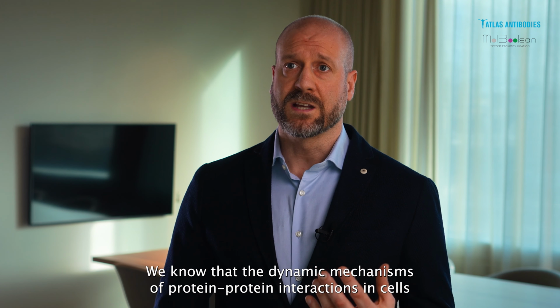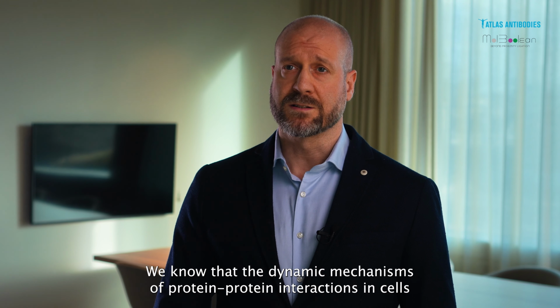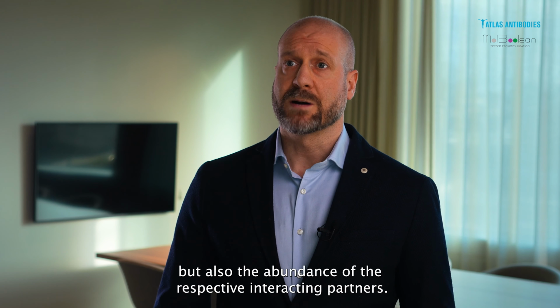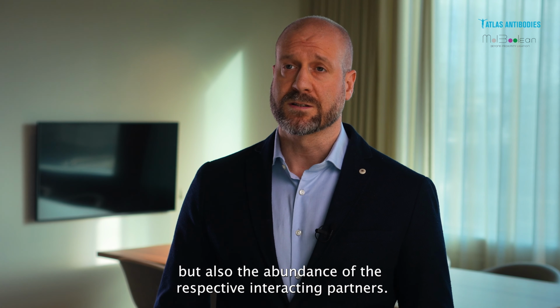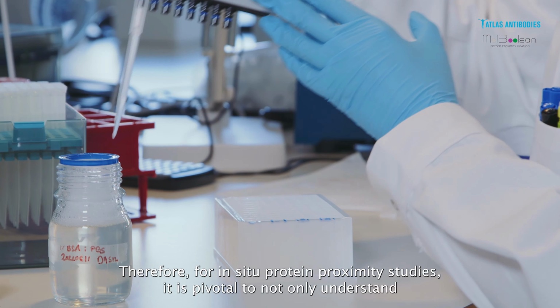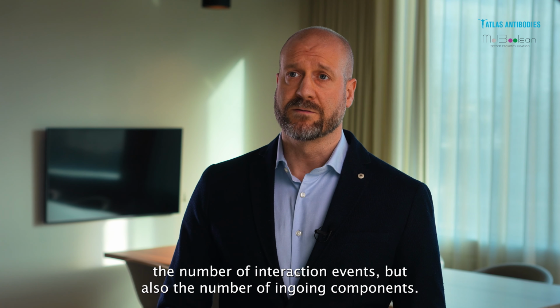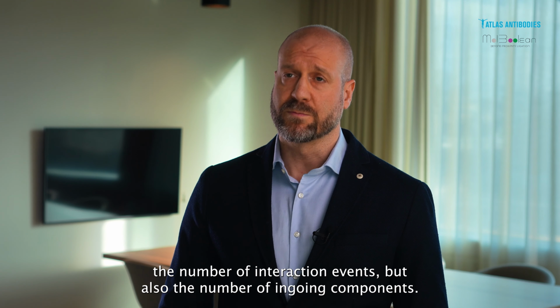We know that the dynamic mechanisms of protein-protein interactions in cells are heavily dependent on the spatial location, but also the abundance of the respective interacting partners. Therefore, for in situ protein proximity studies, it is pivotal to not only understand the number of interaction events, but also the number of ingoing components.